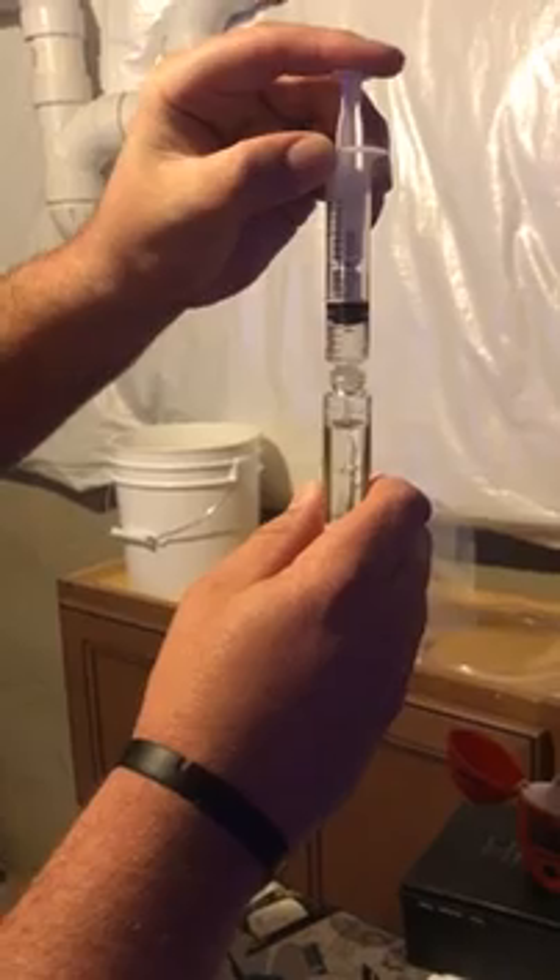I'm going to go draw 10 mL out of it with a syringe. The cuvette's like any other test cuvette — it's just got a line you fill to.